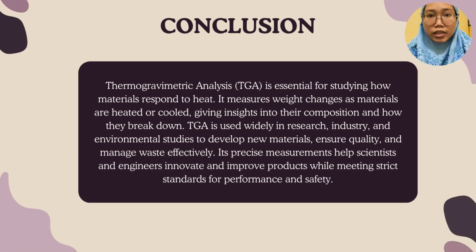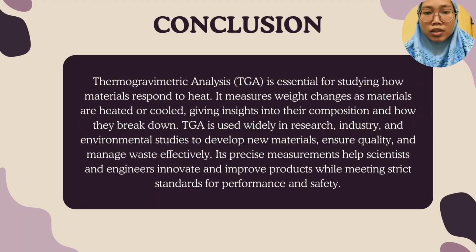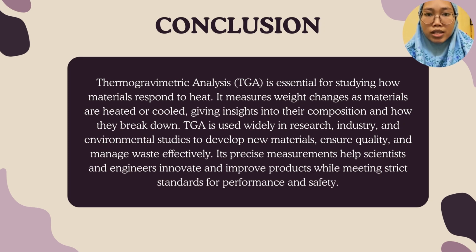For the conclusion, TGA is essential for studying how materials respond to heat. It measures weight changes as materials are heated or cooled, giving insight into their composition and how they break down. TGA is used widely in research, industry and environmental studies to develop new materials, ensure quality and manage waste effectively. Its precise measurement helps scientists and engineers innovate and improve products while meeting strict standards for performance and safety.